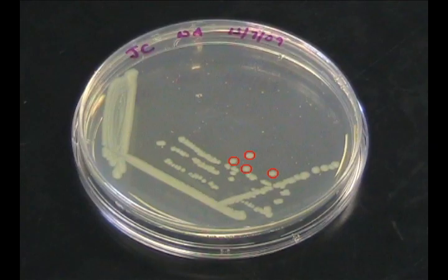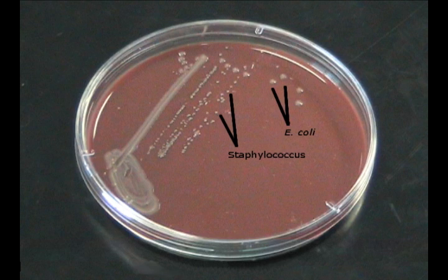Following incubation, you should be able to see single isolated colonies. On this chocolate blood agar plate, you can see different colony morphologies of different bacteria. On this plate, you can see the small off-white colonies of Staphylococcus and the larger smooth colonies of E. coli.